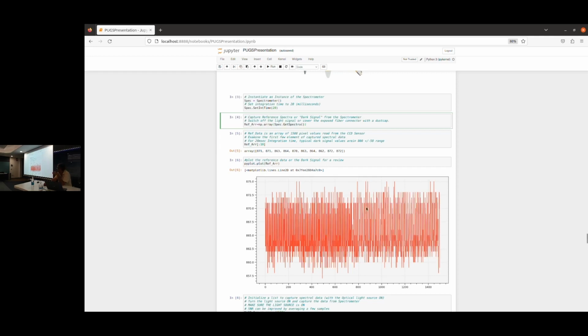If the temperature goes high, this number will go high. If you cool the device, this number will come down. If the temperature goes high, the leakage current will go high, so the reading will go up. If the temperature cools down, this reading will come down.